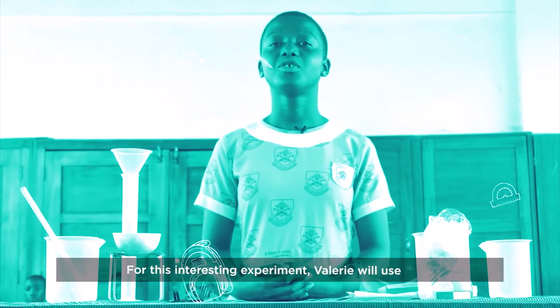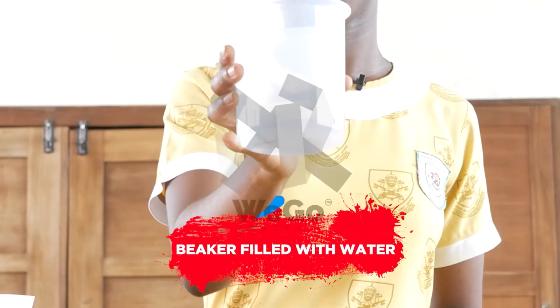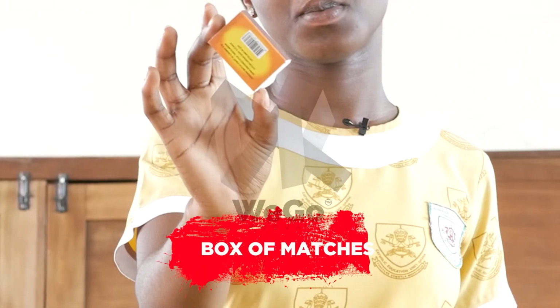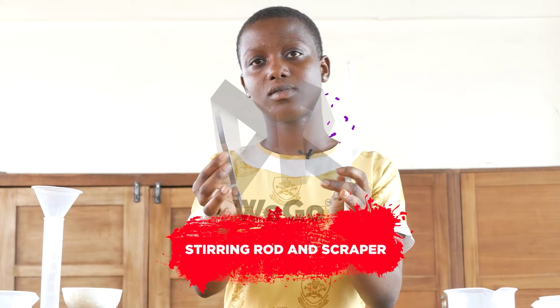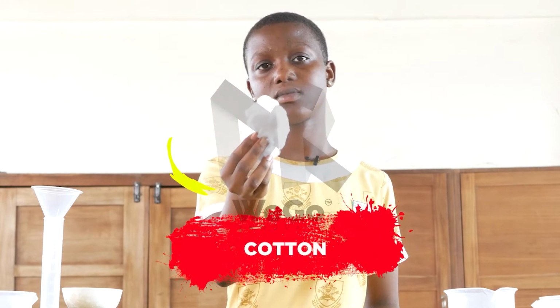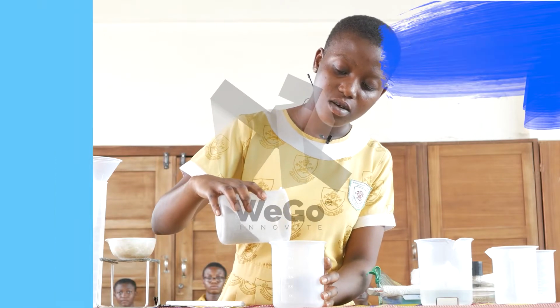For this interesting experiment, Valerie will use a measuring cylinder, a pair of tongs, a beaker filled with water, a beaker filled with sand, a box of matches, an evaporating dish and a stand, a stirrer and a scraper, some filter paper, and cotton. Now let's see how Valerie demonstrates this intriguing experiment.